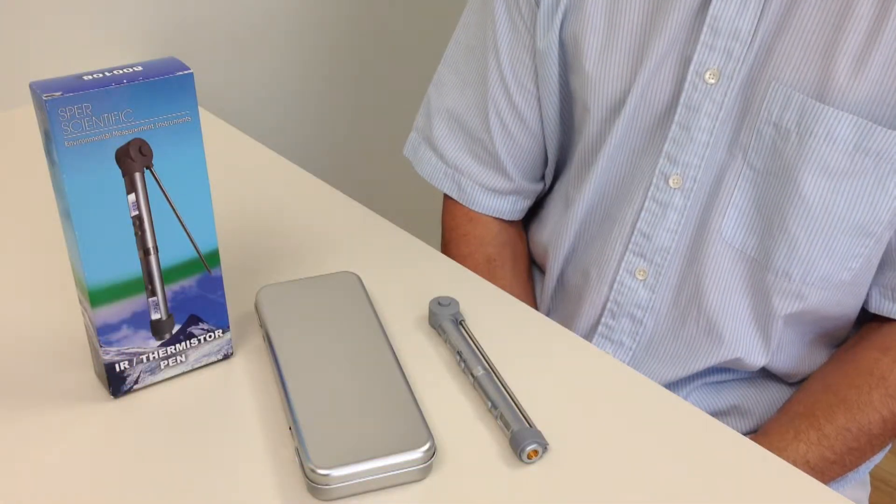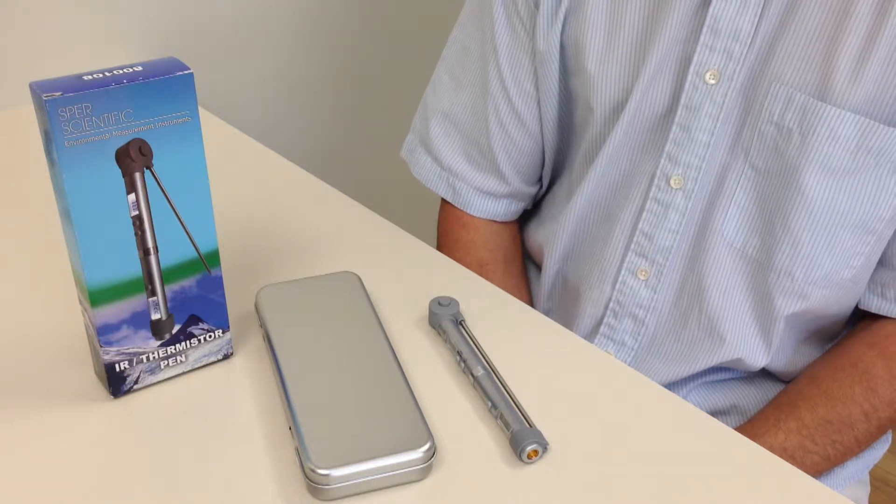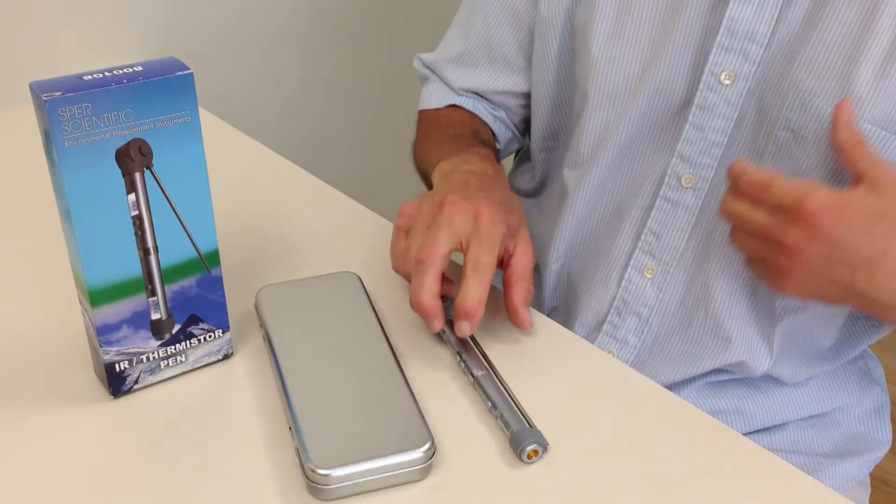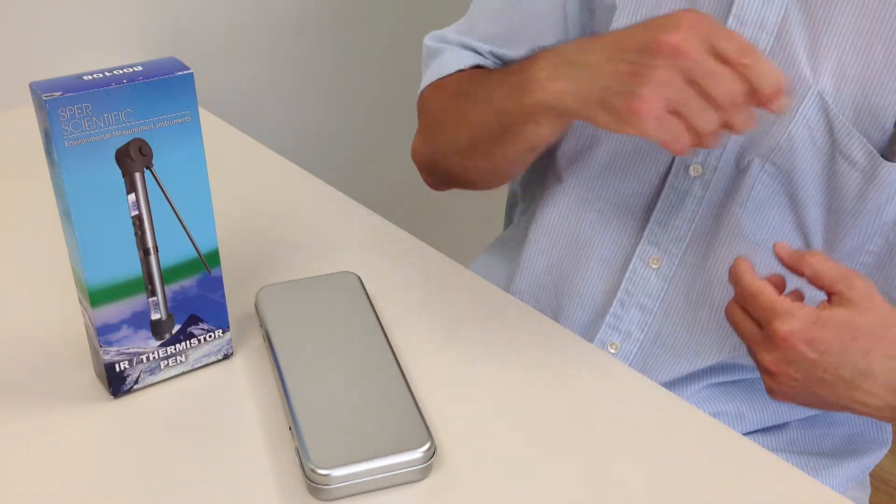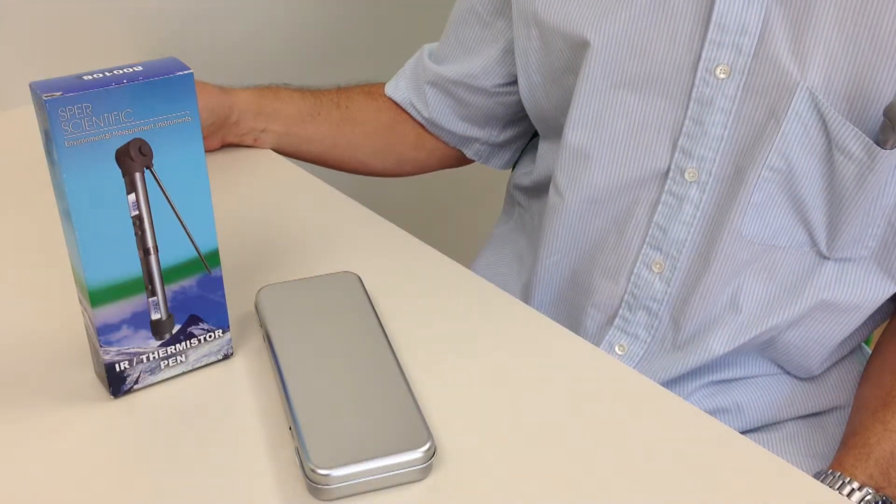With both a contact and non-contact thermometer, you can carry Spear Scientific's IR thermistor pen in your pocket and always have a solution for any temperature measurement application.